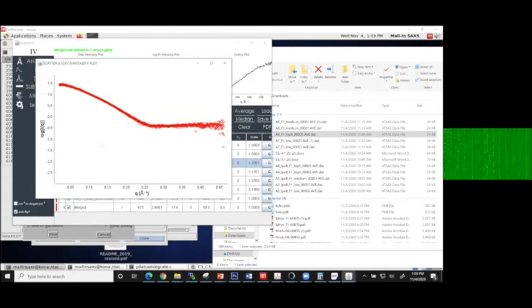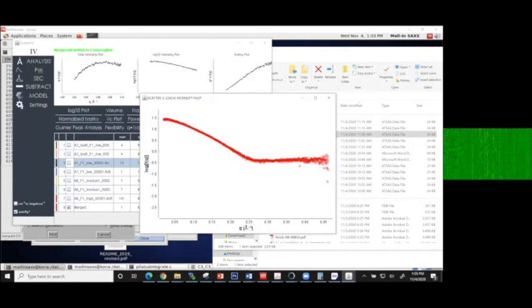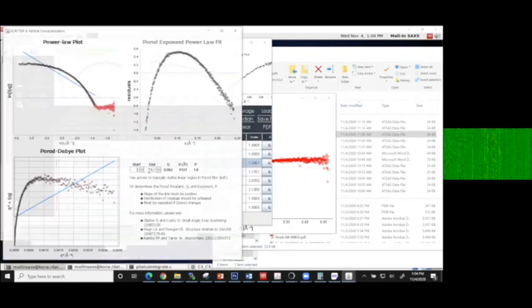All right, so the next step is, I'll just go through the steps here for the basics. Primus has tools for all of this as well, and you'll develop likes and dislikes for different functions from different tools. So the first thing I typically do is go through the volume. I'm going to find the volume of the system, and by finding the volume of the system, I'll be able to extract the mass of the system.